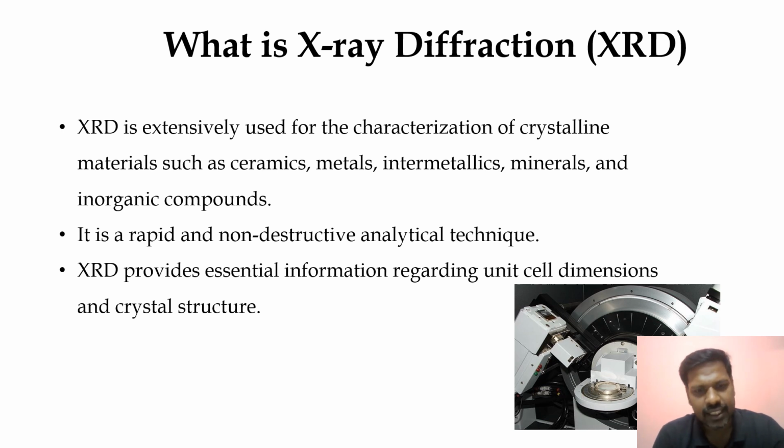X-ray diffraction is a non-destructive technique used to analyze crystalline materials. It is commonly used for ceramics, metals and alloys, minerals, and inorganic compounds. XRD provides information about crystal structure, unit cell dimension, and phase composition.